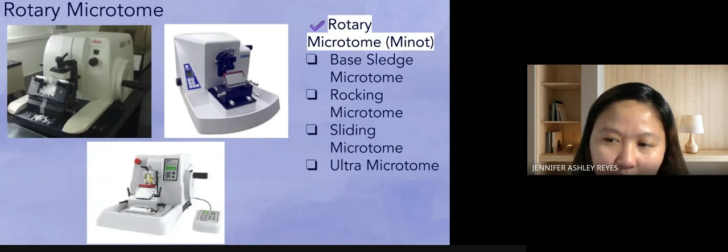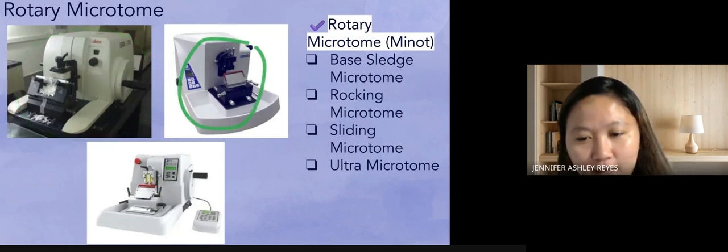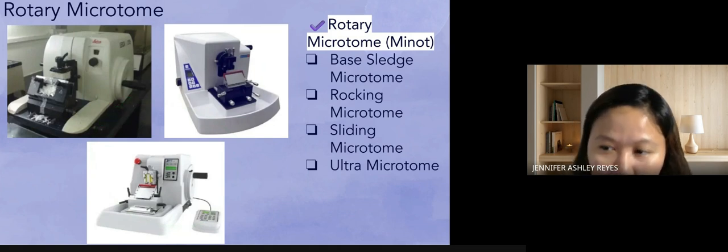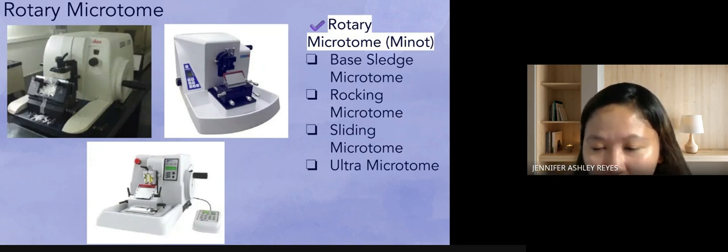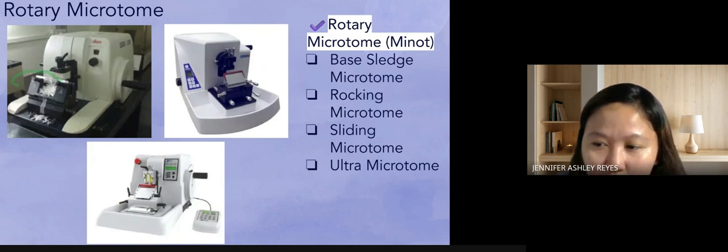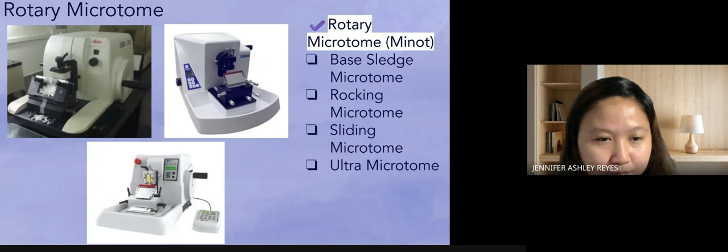So these are the different rotary microtomes: manual, semi-automated, and fully automated. Because the machine is heavy, it is stable during cutting and does not vibrate, so it's possible to get serial sections. The angle of the cutting blade and the knife may be modified. You can adjust or adapt that depending on whether the tissue is hard, fragile, or fatty.